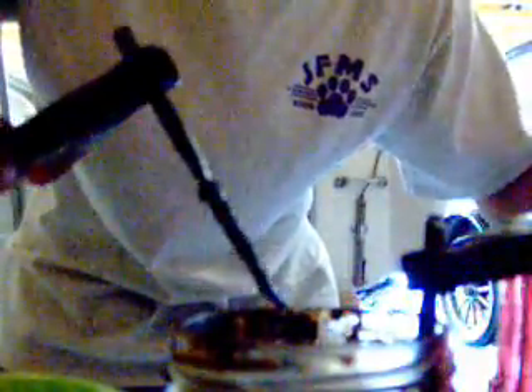Every once in a while you have to clean this out, because it can be kind of explosive on the end of it. It'll be pretty hot, so just take something and scrape it off, and then put it back in. Do that every once in a while to keep it clean.